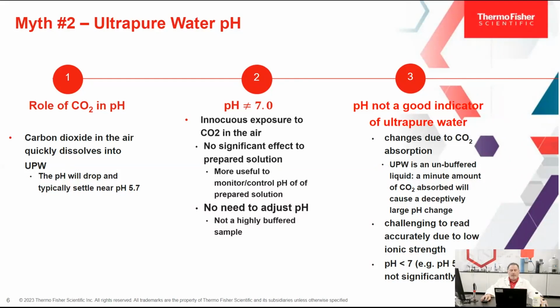With this pH variation from 7, is that going to affect any solutions that I prepare with the water? In most cases, we don't expect a significant effect. CO2 will be present in any solution that we prepare in an air atmosphere. In general, it may be more useful to monitor and control the pH of the prepared solution than the pH of the ultrapure water used to make the solution.